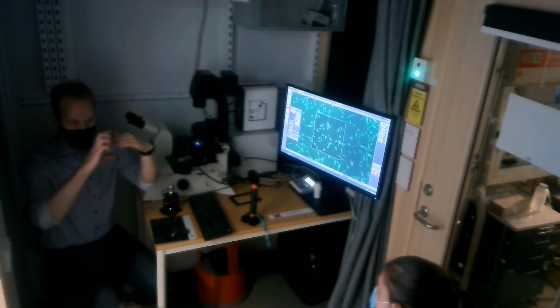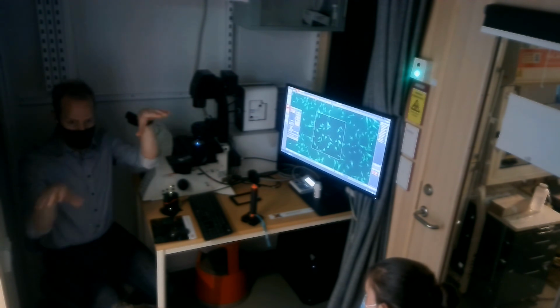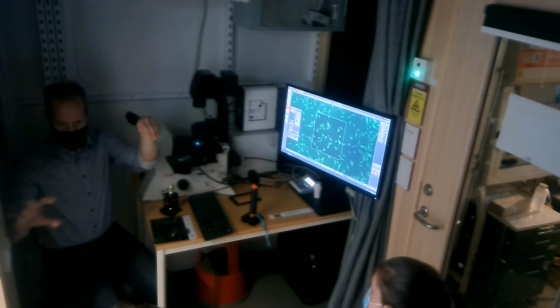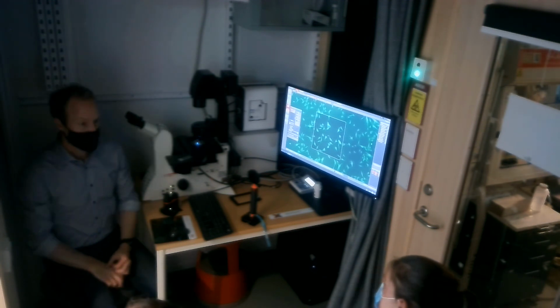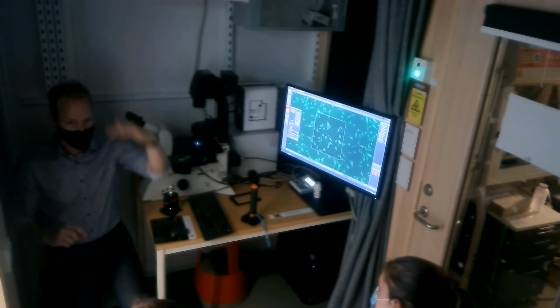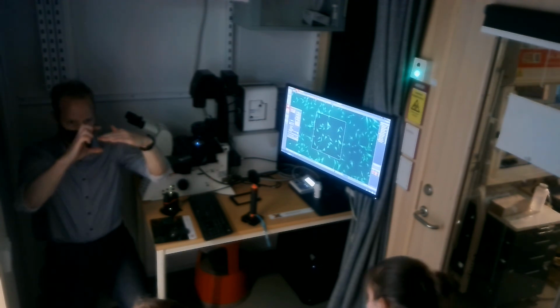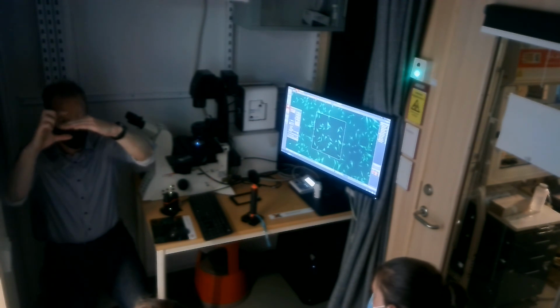As the focus map is interpolated between these positions, the Z stack will also go like this. And if you're using autofocus, it's the same thing. If you're doing an autofocus job here, it finds the focus there, and the Z stack will be symmetrical around it. It goes to the next place, does a focus job, finds the focus there, and it will be symmetrical around there.